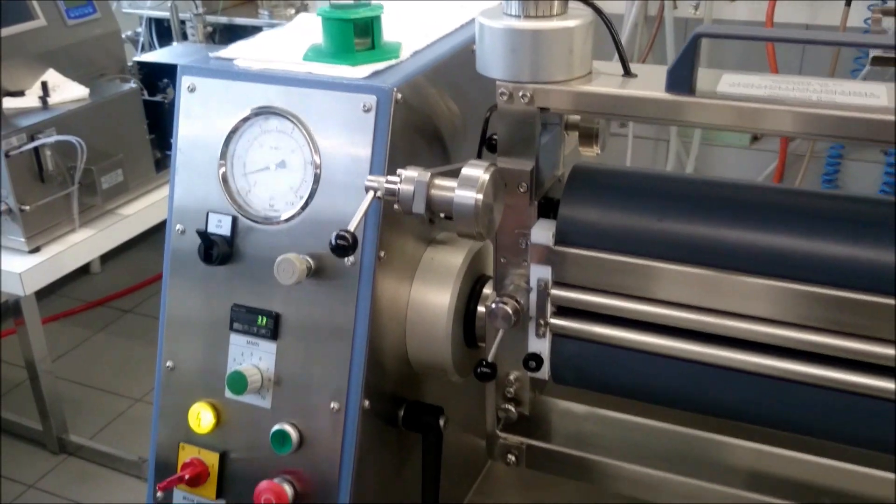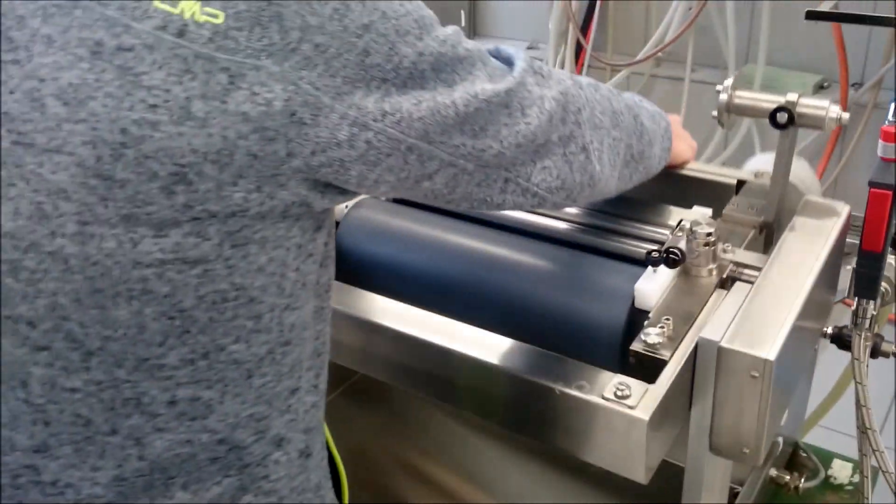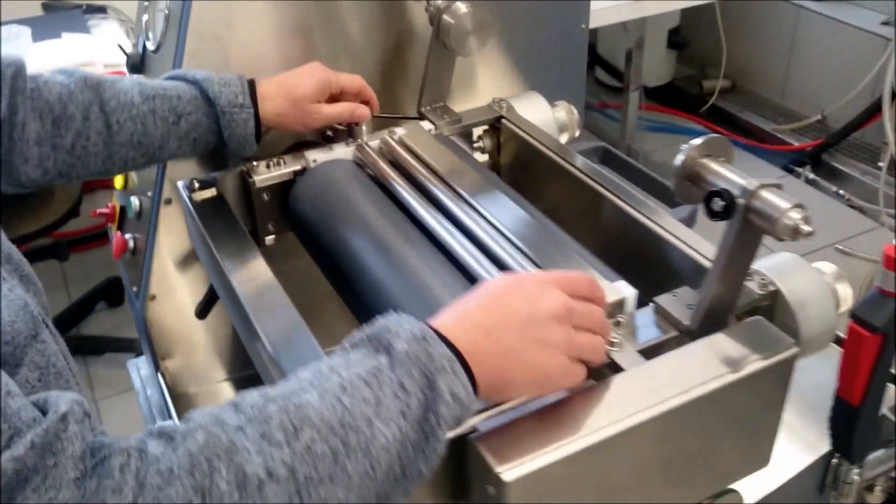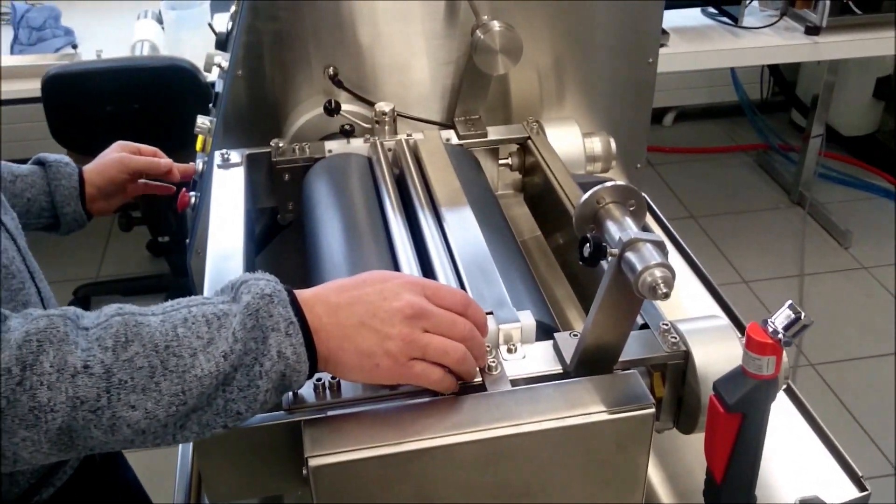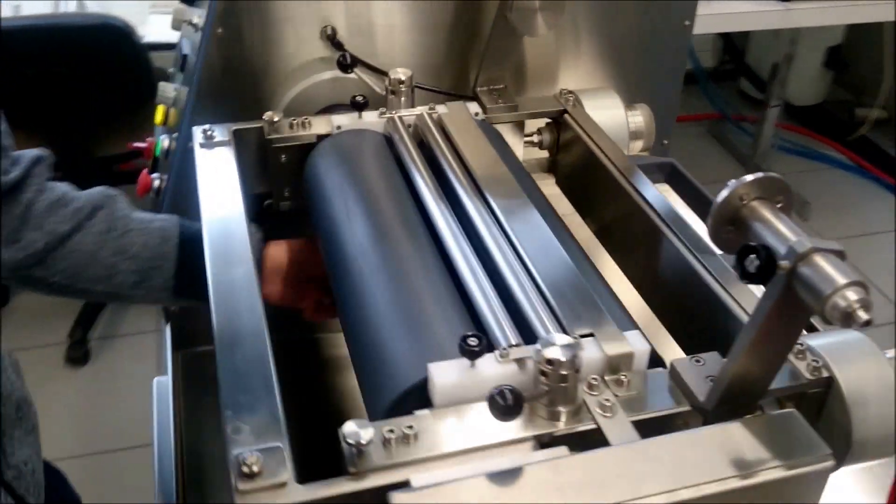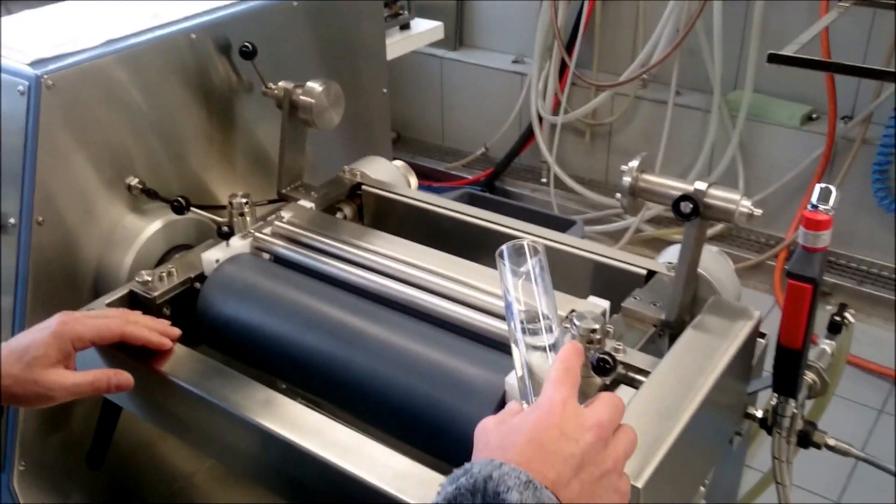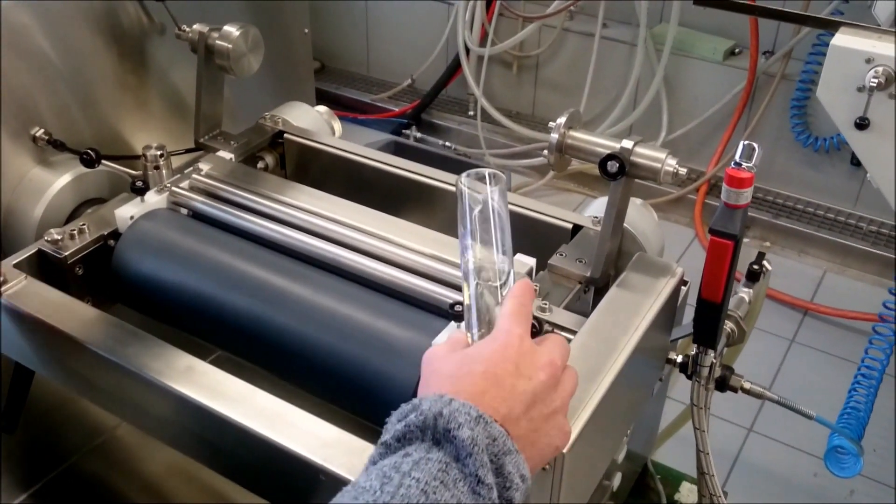First I show you the possibility to work in horizontal position with nip padding. So we close the seals. We close the outlet of the liquid.